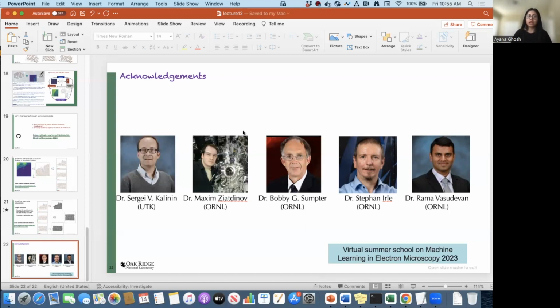Again, we are working on developing some of these theoretical proxies that would more rightfully address the disparities in the time and length scales. For now, the way we do it is to bring in more of the human in the loop to identify regions of interest that would well represent the system that we are looking at during our experimental characterization.